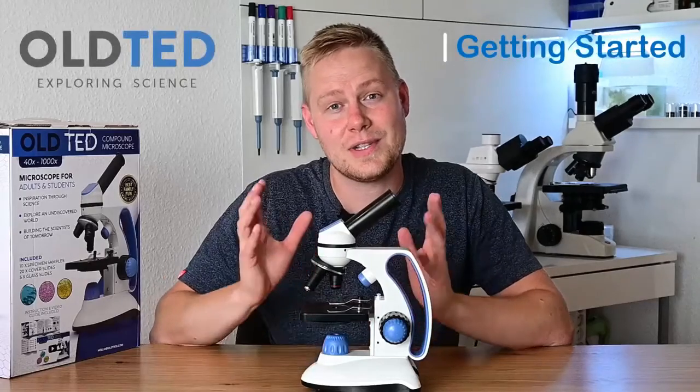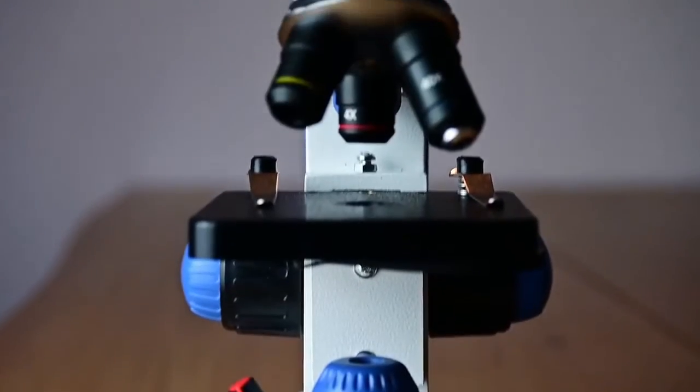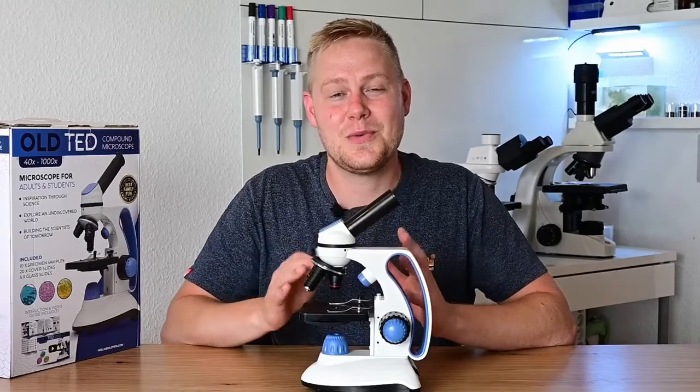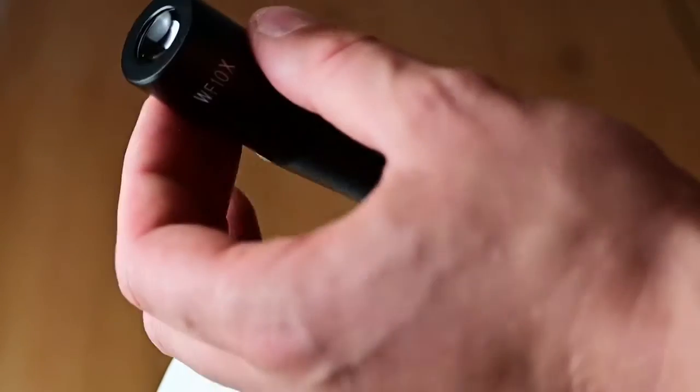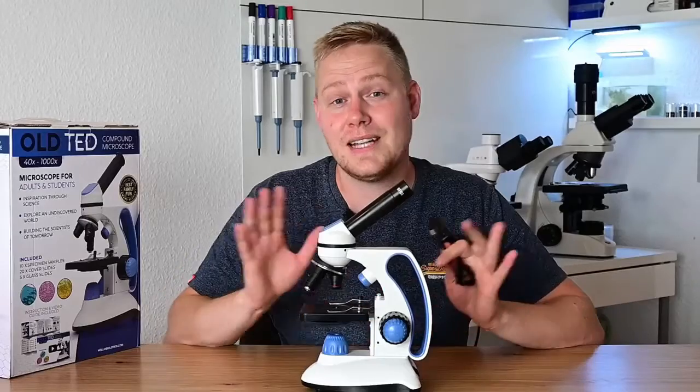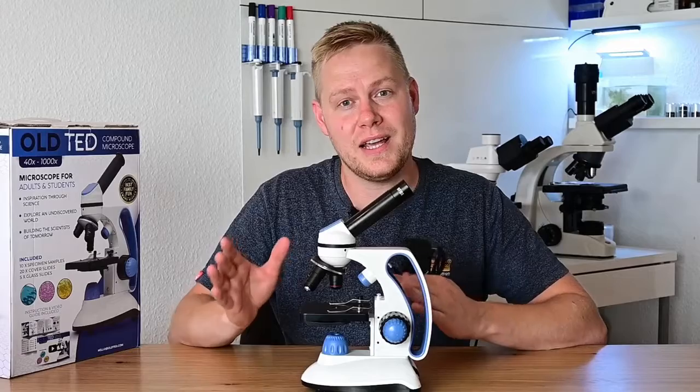Let's have a look on how to get started using your brand new microscope. First, you need to insert one of the included eyepieces. This one is the 10x. Then we insert the power supply or 3 AA batteries.